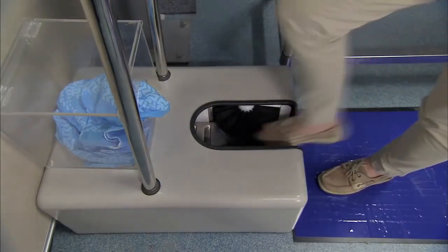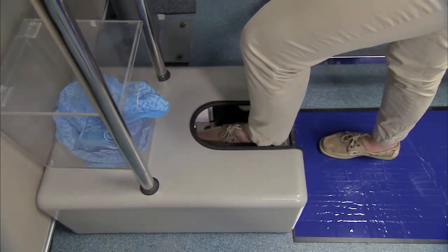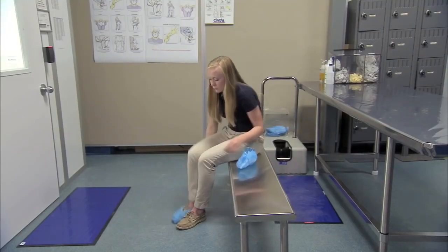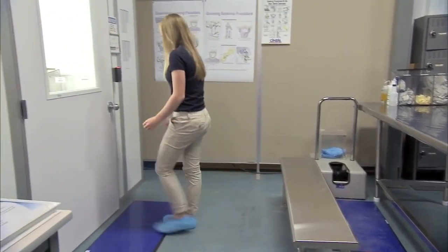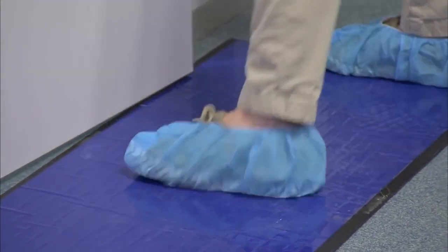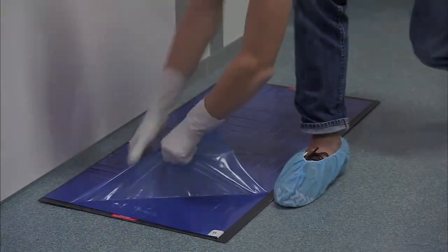If shoe cleaners are provided, then use them as demonstrated. Put booties on your feet to prevent tracking in particles. As you enter the cleanroom, take care to step on the adhesive sticky mat, which further prevents particulate contamination. If the adhesive sticky mat is dirty, remove the dirty layer to expose a clean layer before entering the room.